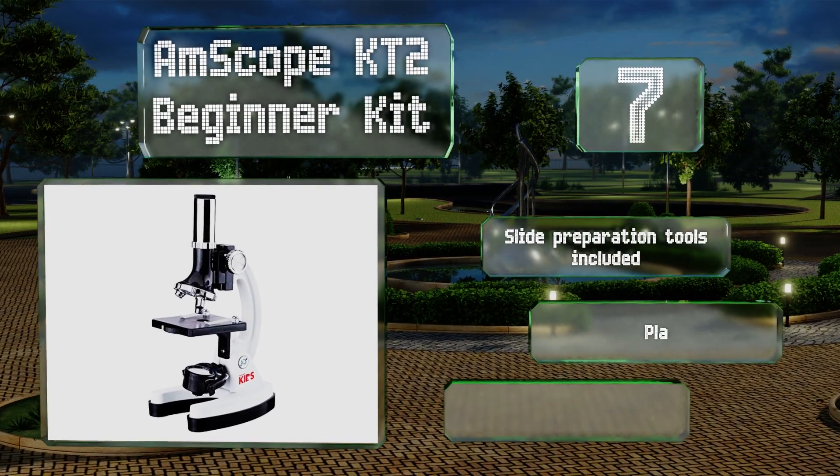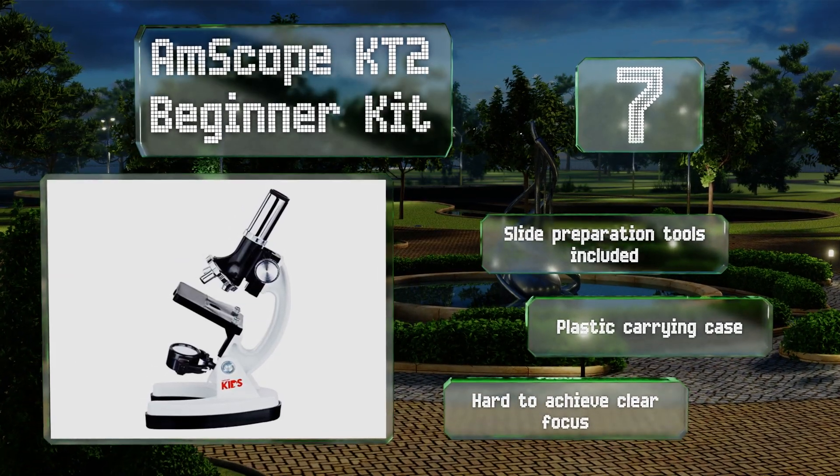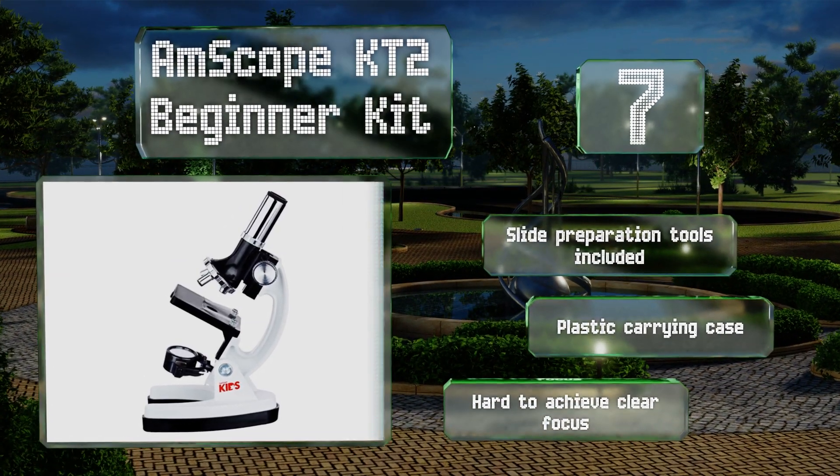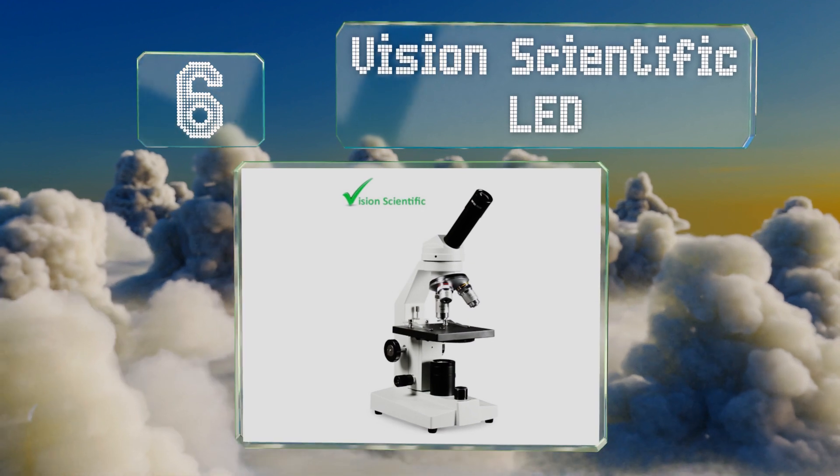The AmScope KT2 does offer impressive 1200 times magnification power. It includes slide preparation tools and a plastic carrying case, but it is hard to achieve a clear focus.